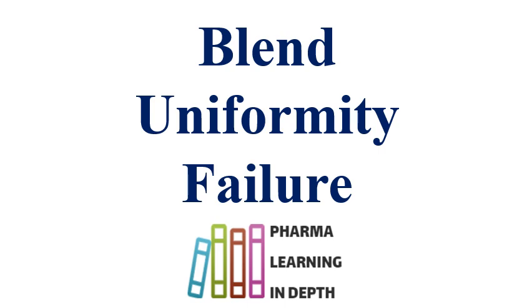In the manufacturing of tablets and capsules and other solid formulations like granules and sachets, a blend is prepared of the drug substance along with the excipients, and the blend is tested for uniformity and assay. Other parameters are also tested, like LOD or water content, flow properties, particle size distribution, bulk density, and tap density. These are the quality parameters of the blend.